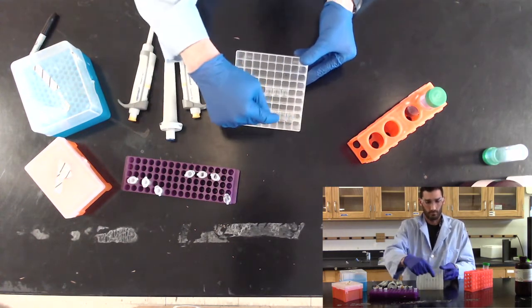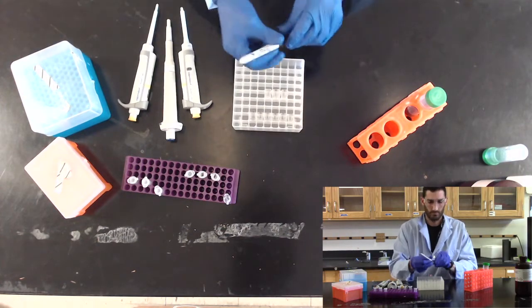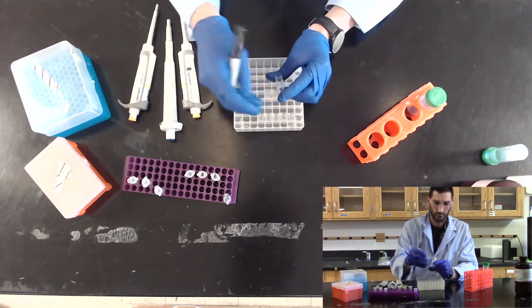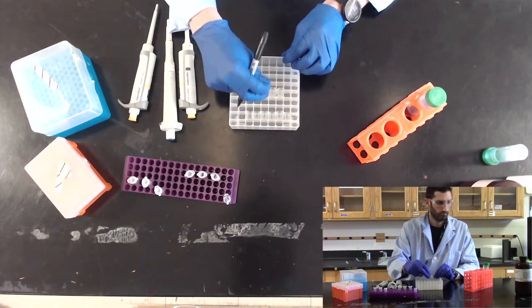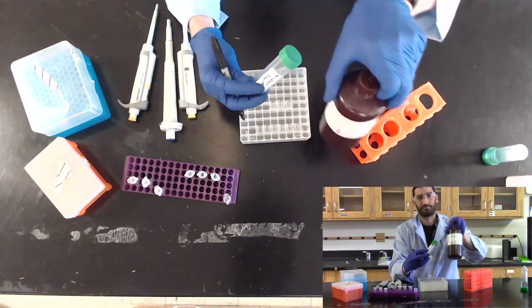To measure the concentration of the protein that you have purified, we will be doing a Bradford assay. To do this, obtain 6 cuvettes for your protein standards and 3 cuvettes for your protein sample. Label your cuvettes 1 through 6 for your protein standards and 1 through 3 for your protein solution.